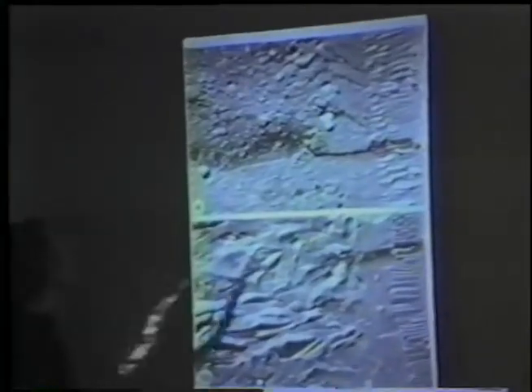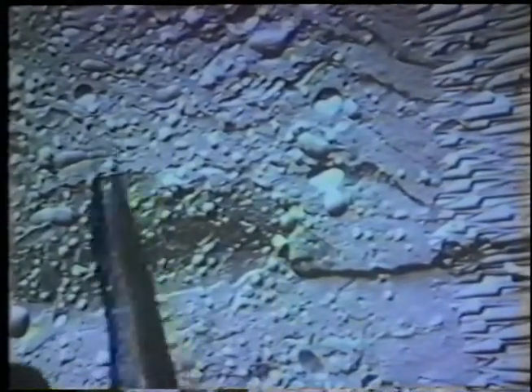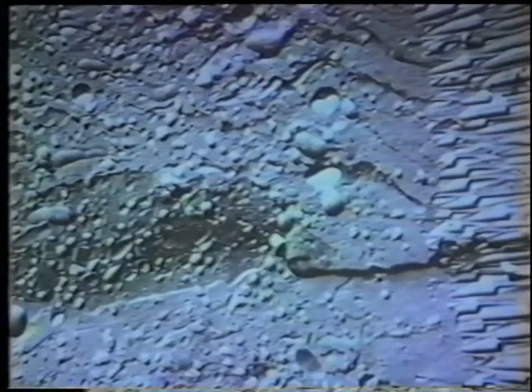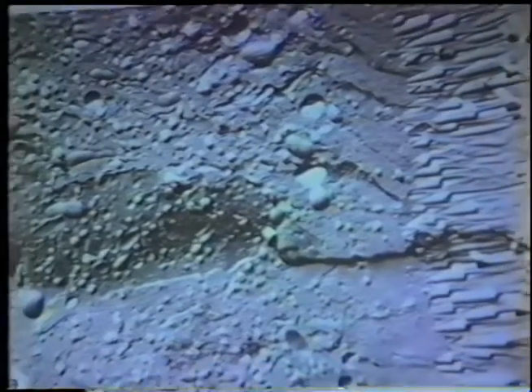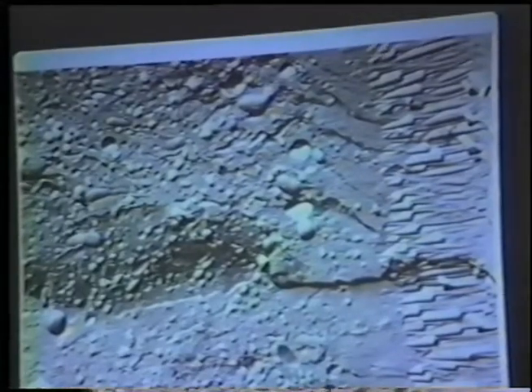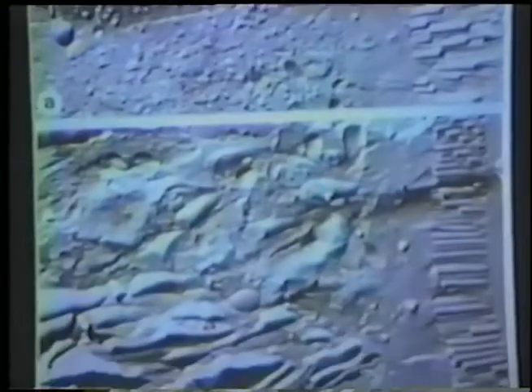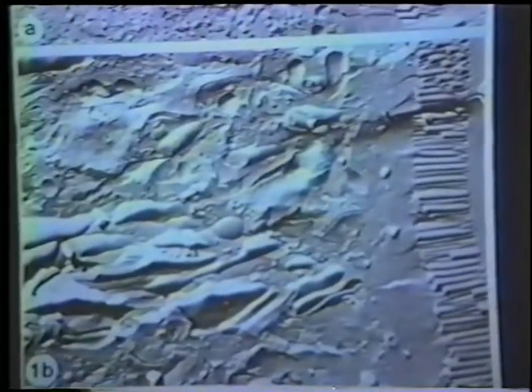Okay. Here we have a rat intestinal epithelial cell. This cell was only glycerinated and then frozen. And you can see that there are very few intact and distinct membrane systems left in the cell. All the membranes have been vesiculated. This cell was chemically fixed. It was fixed with glutaraldehyde before addition of glycerol. You see the membrane systems are reasonably well intact and distinct as they must be.